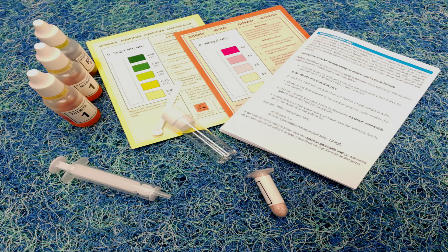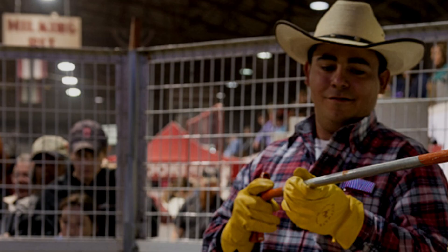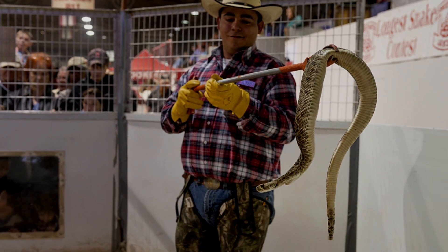Most quality kits will comprise of a collection of plastic test tubes, liquid reagents, and colored card charts. To complete the test you add a measured amount of pond water to the test tubes, add reagents as per instruction, and then make a color comparison from the cards. There are simple tests that just use a dipstick, however the accuracy of these is questionable, so they are best avoided.